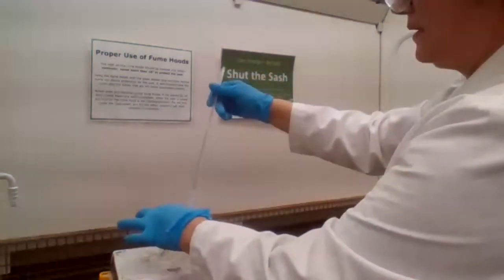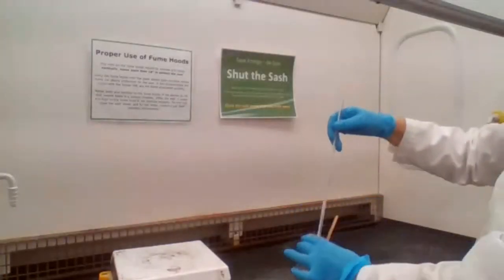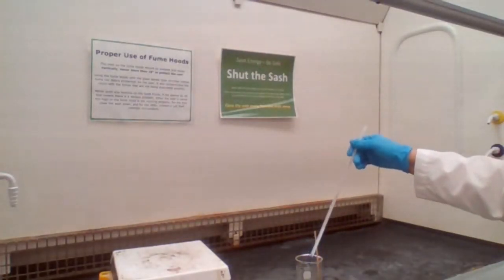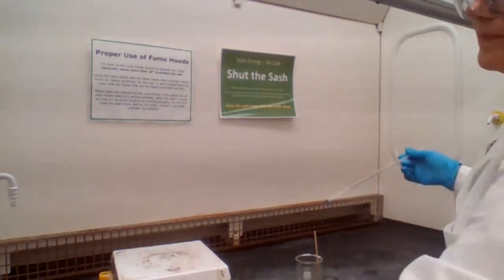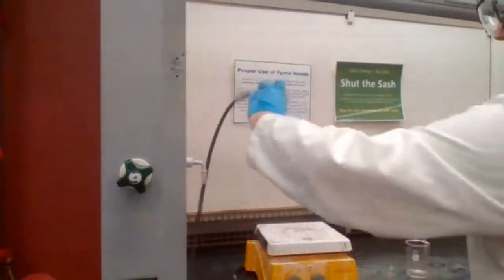I have enough liquid here. I can do that. Okay, temperature is way past 60. Definitely there is no ether there. And I stop the heat at this point. My next step would be to measure the mass and get the percent yield.